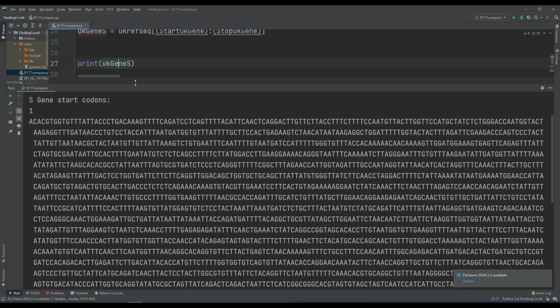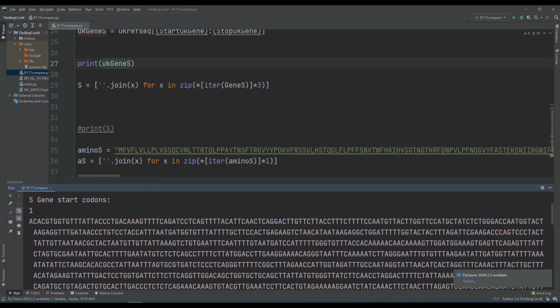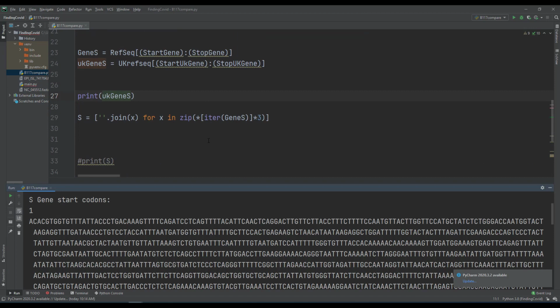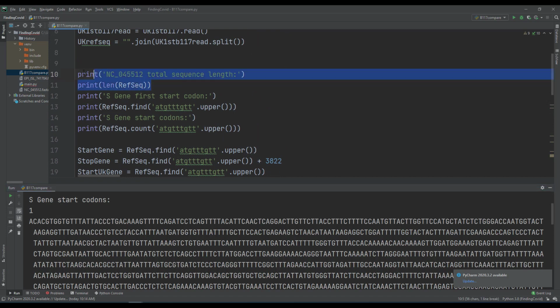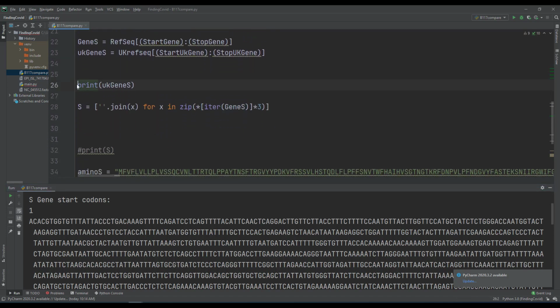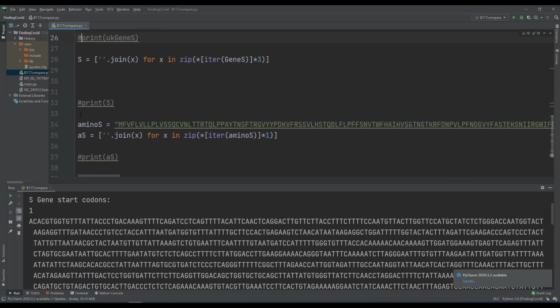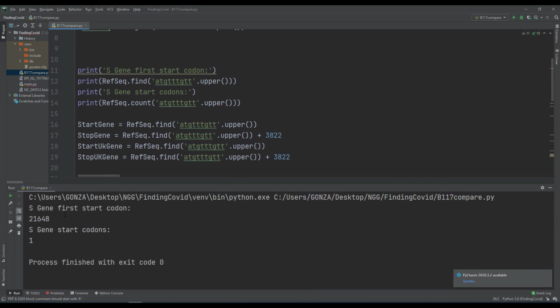This is not the right location, and I'm going to show how I figure out what is going wrong. The first thing I want to do is clean up this little area right here. I don't need this. To figure that out, I'm going to hide all the prints too. I don't care for those right now.